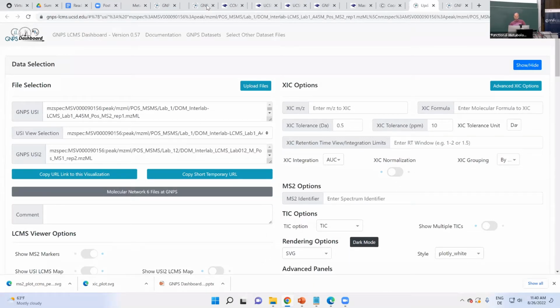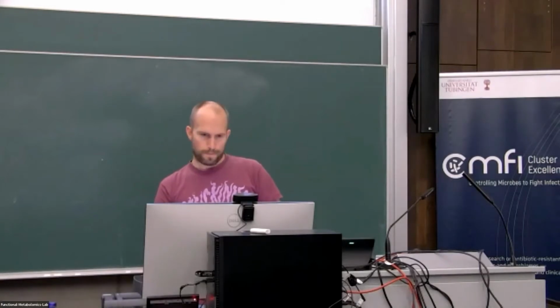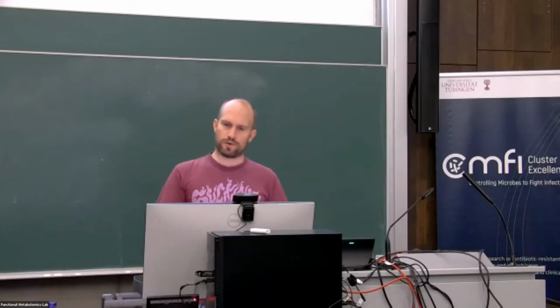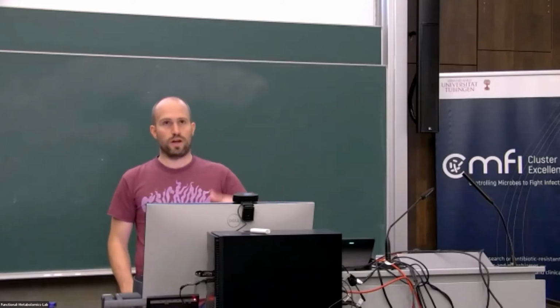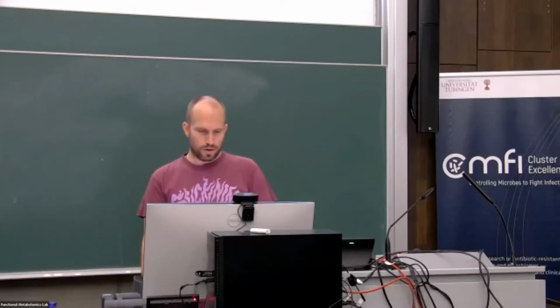What was the mass? Then after a couple of seconds, once it's loaded, hopefully I will see all 6 files, and I can display them separately or overlay them or whatever I want.